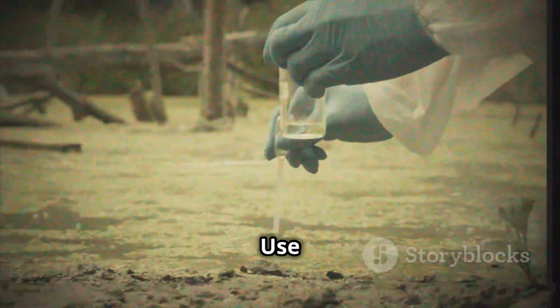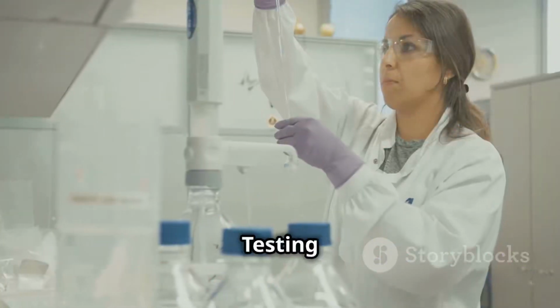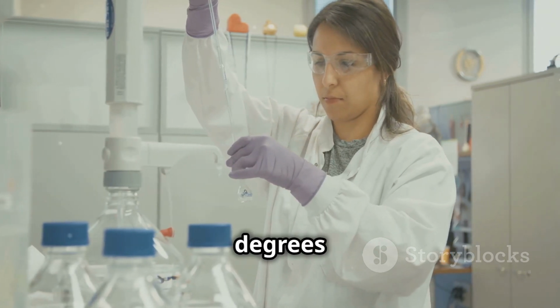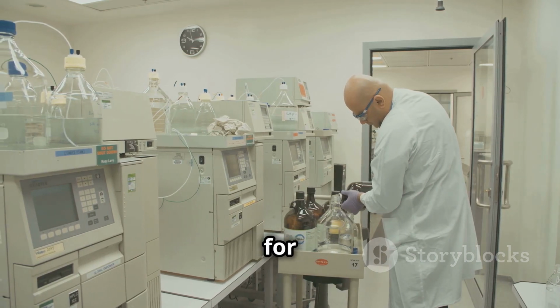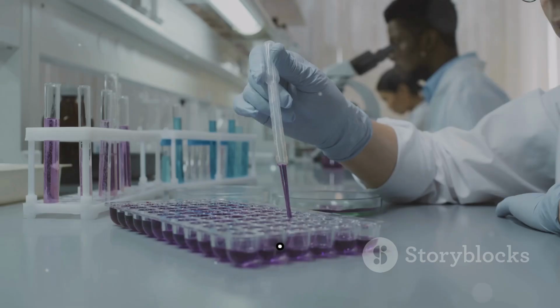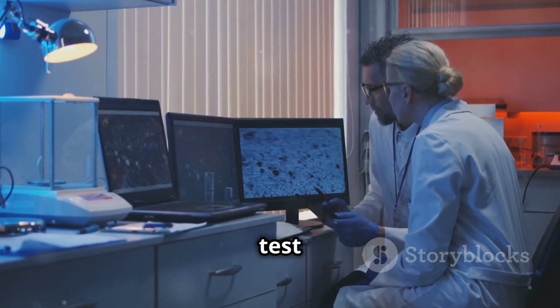Sampling techniques. Use aseptic techniques with sterile containers labeled with location, date and time. Microbial testing: membrane filtration or pour plate method. Incubate samples at specified temperatures, 20 to 25 degrees Celsius and 30 to 35 degrees Celsius. Chemical testing, conductivity testing: measure at various points for ionic purity. TOC testing: monitor organic contaminants using validated methods, for example, USP. Endotoxin testing: for WFI, use LAL testing to confirm compliance with endotoxin limits. And trend analysis: monitor test results over time to detect deviations.